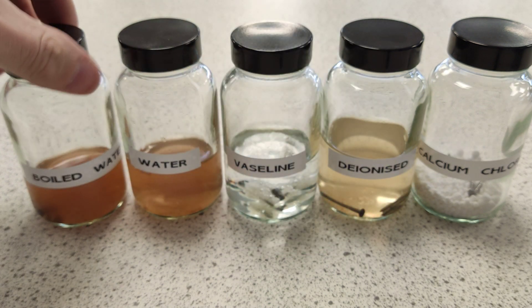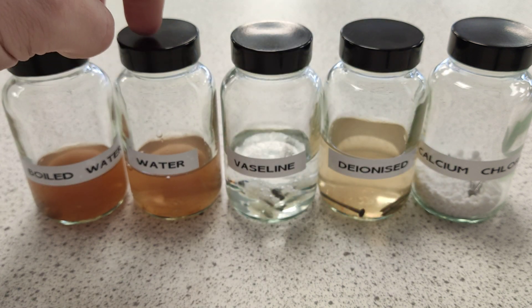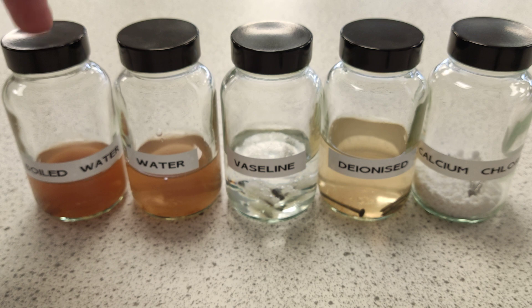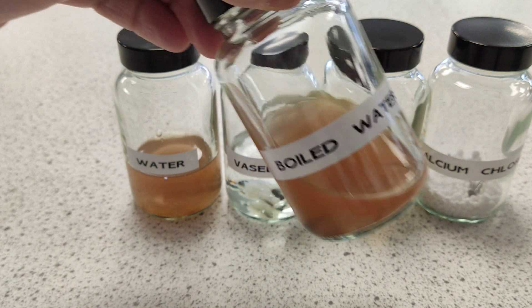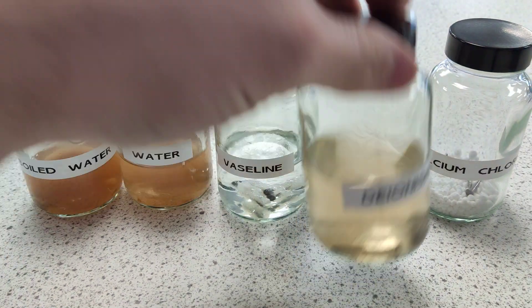It's interesting because the boiled water and the standard water are about the same actually, so even boiling it - I think the problem is that some of the oxygen and gases can dissolve back in. Let's pick out the deionized - I thought I'd try deionized water.